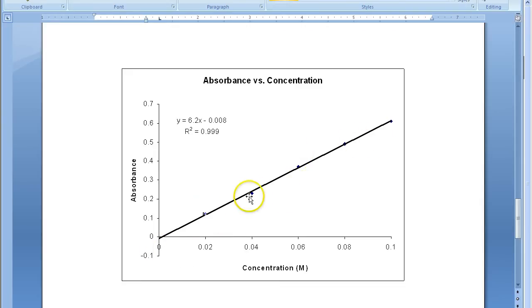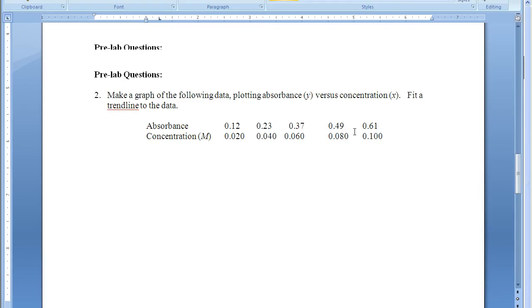We don't just want to put the line through the data points. We actually want to add the equation of it, because that's going to be very important, not just for pre-lab question three, but also for our data analysis. What this line is going to allow us to do is to record the absorbance of solutions that we do not know their concentration.